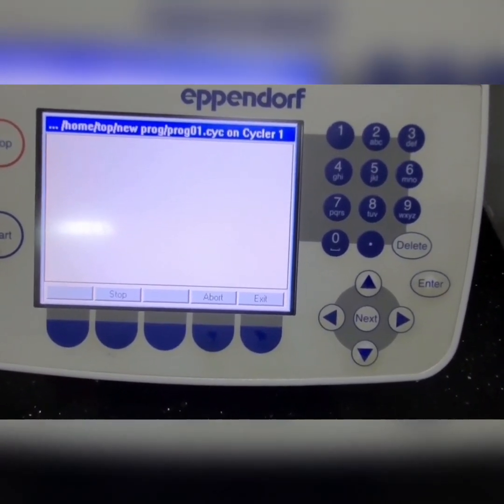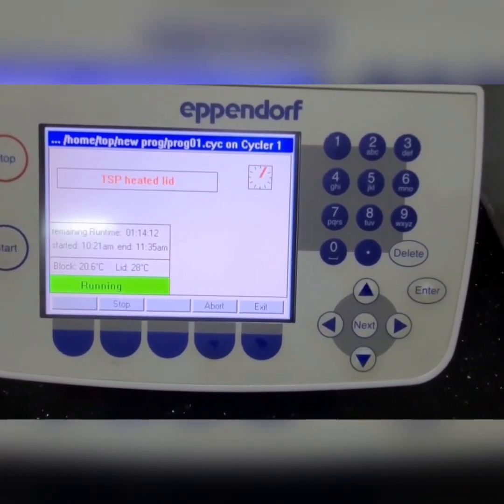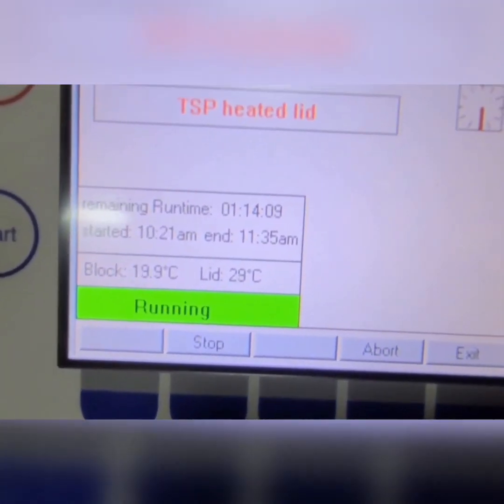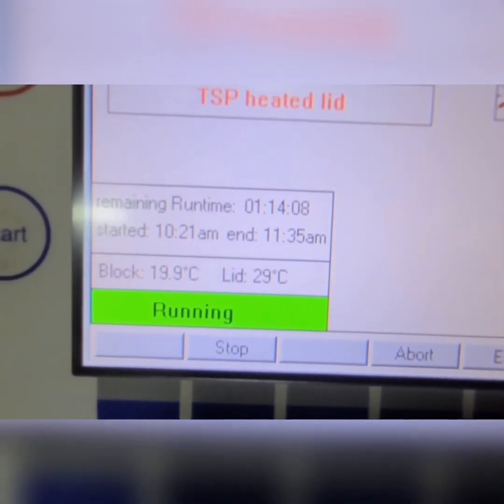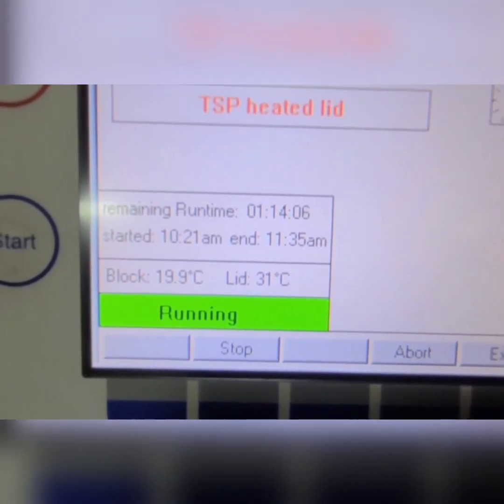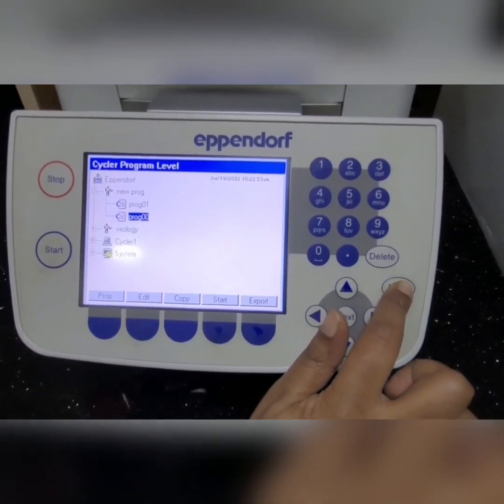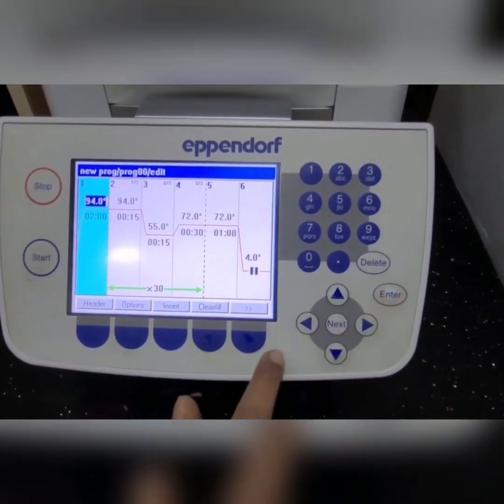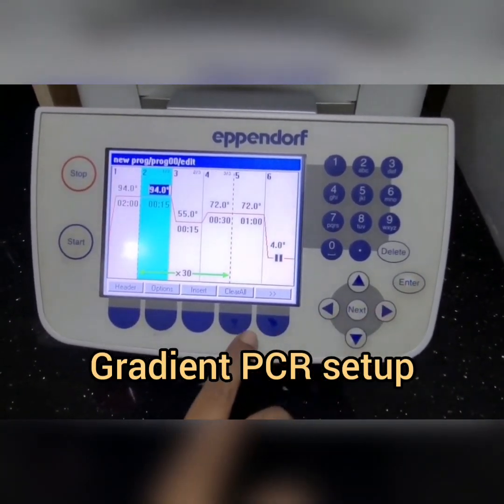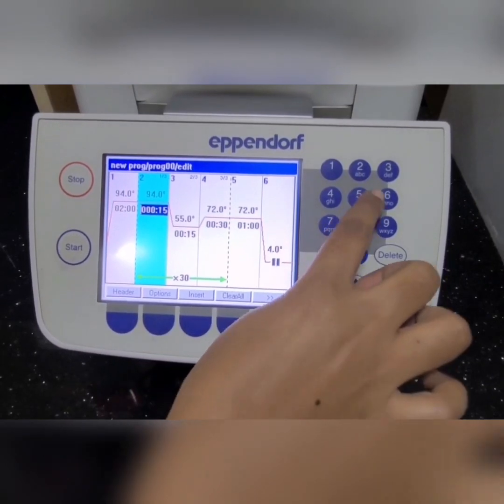When the program starts you can see the display showing green color with 'running', and it shows the start and end time as well. Now we are going to see how to set up a gradient PCR reaction.